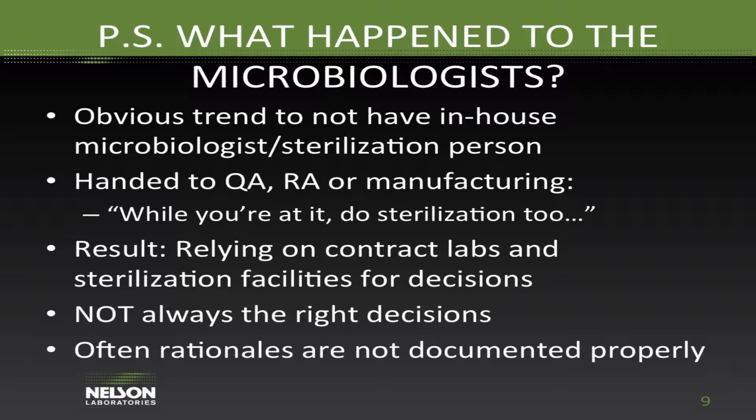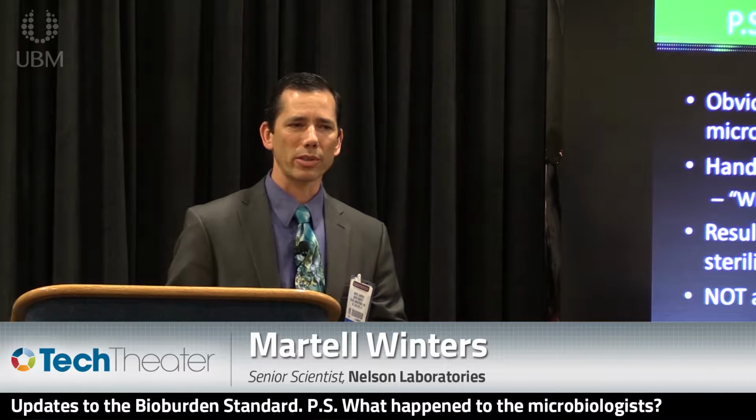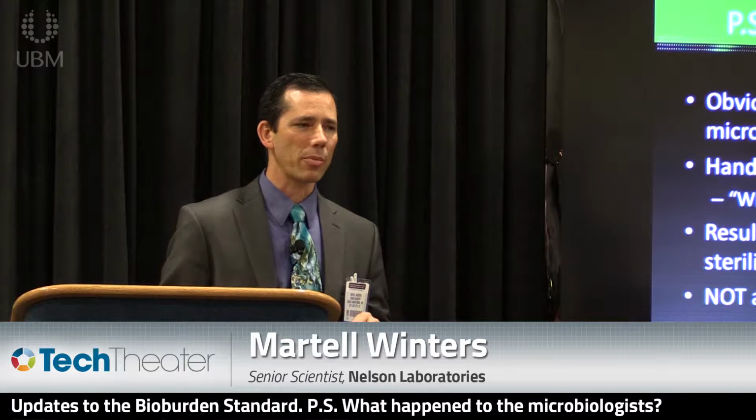And one of the biggest things that we see is that after we have discussions on the phone with the facility, the result of the discussion, the rationales that are used to decide on a certain microbiology test or to decide on a certain validation approach for sterilization, those are not properly documented.